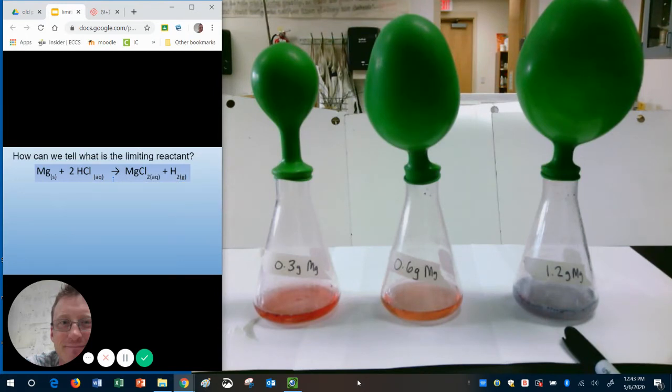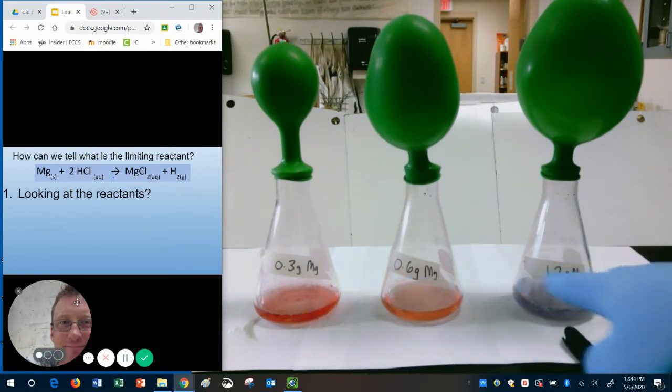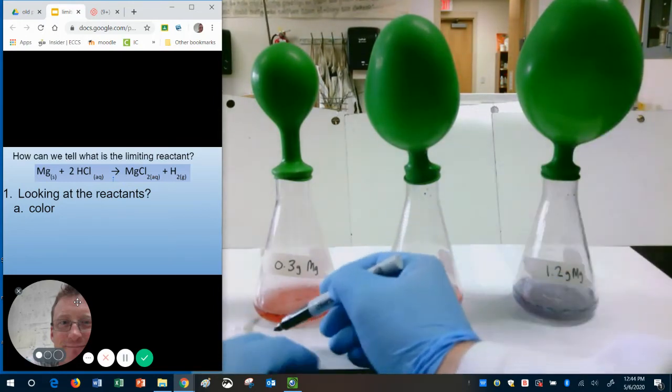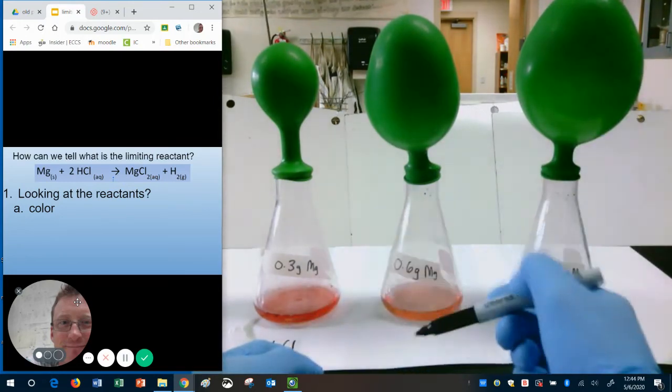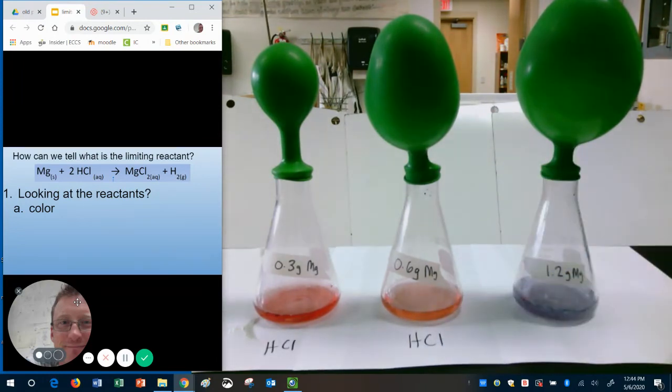So, what do we do with this? How can we tell what is the limiting reactant? Well, when we look at the reactant side, if there is HCl left over, any HCl left over in our containers, it should be pink. So, which ones have HCl? Well, the first one must have HCl in it. And the second one must also have HCl in it.